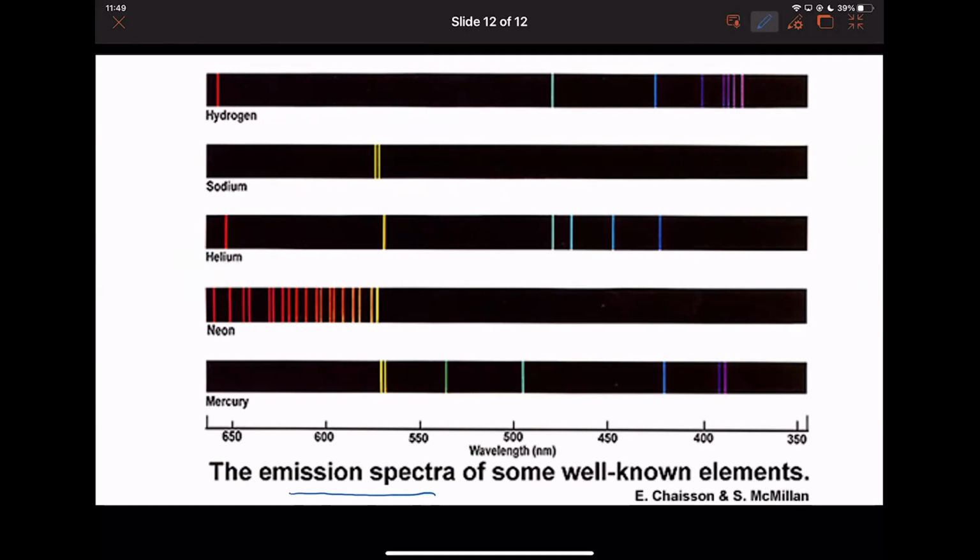So the actual sodium is just these two lines of color. Sodium was that big yellow flame, so when you look at the component colors, it's these yellow lines. Compared to helium, which we didn't look at, but it has these 1, 2, 3, 4, 5, 6 lines of color. That tells you something about the energy levels, the architecture inside of the atom that you can't see.